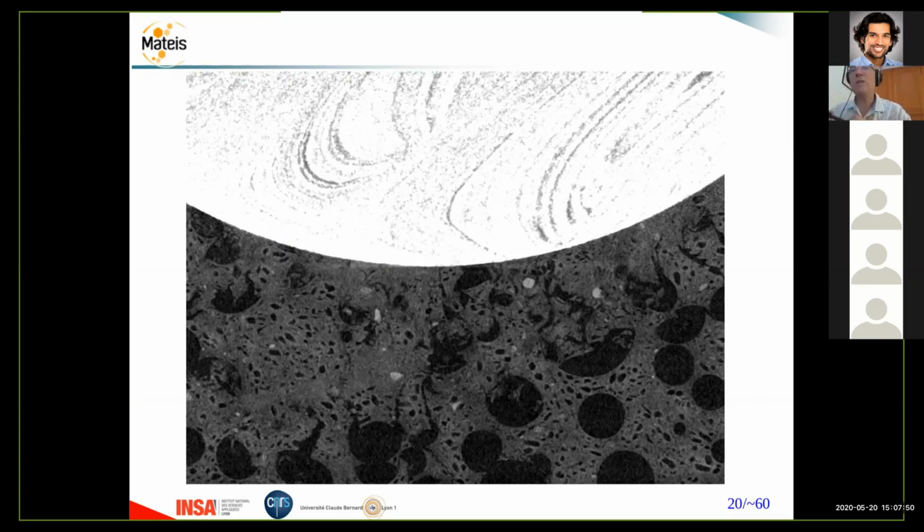And we have a project starting. So yes, it can be used to measure surfaces. The interest is that you can do this surface measurement in an opaque material. This type of surface measurement is normally possible on transparent material, and here we will do it in opaque material.